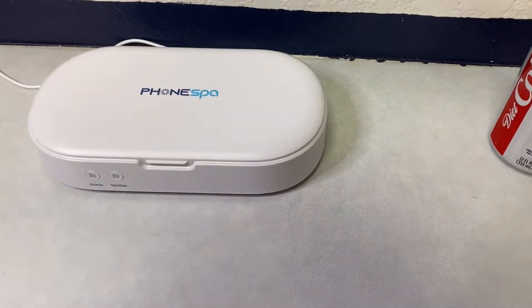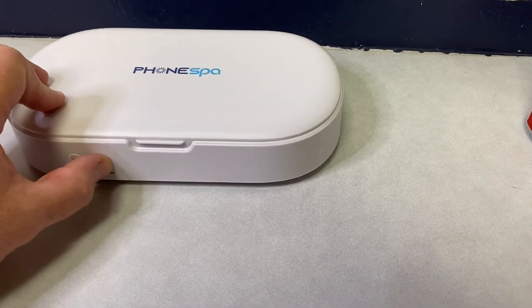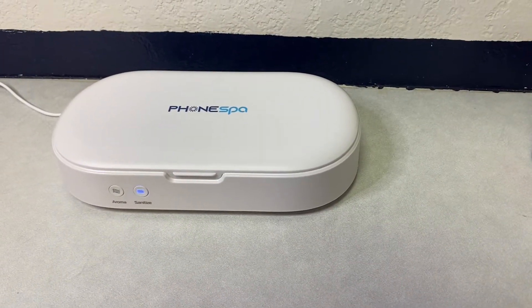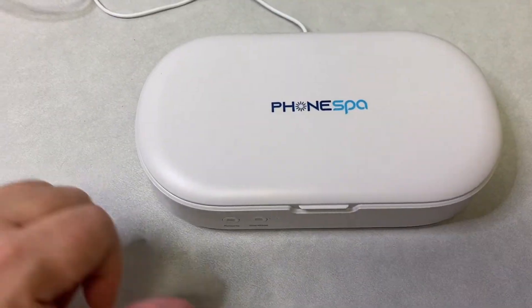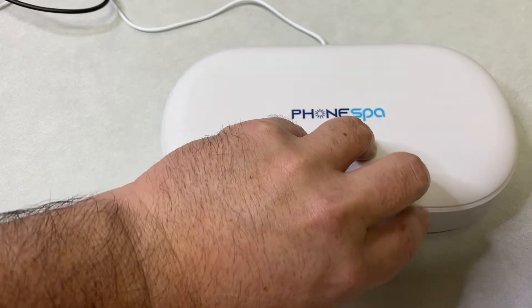I'm going to go ahead and put this in the light. We'll close this up. This one has a timer for 15 minutes, so we will do 15 minutes and then check the result. This is done and we are going to now culture it after.